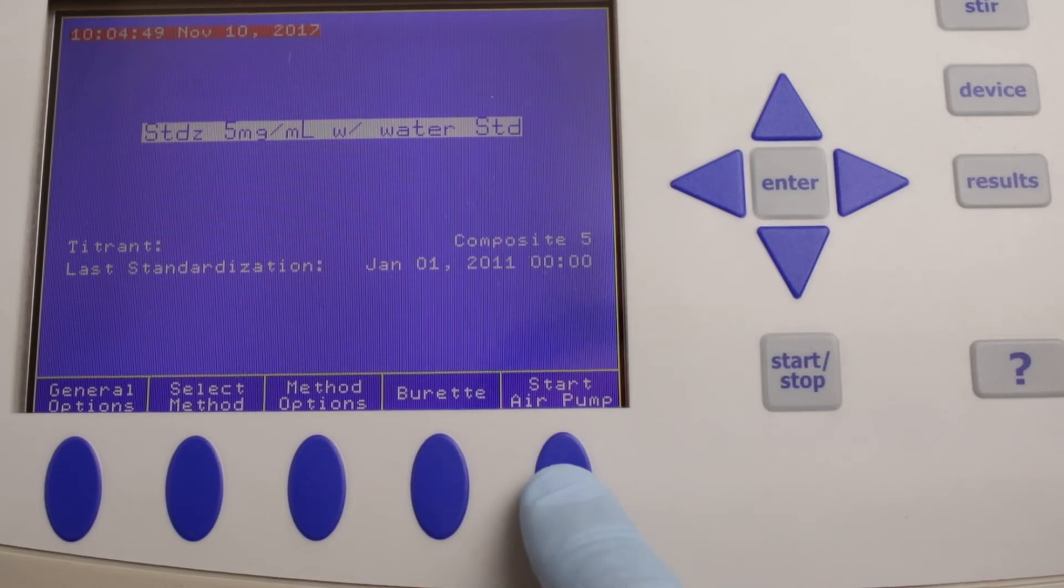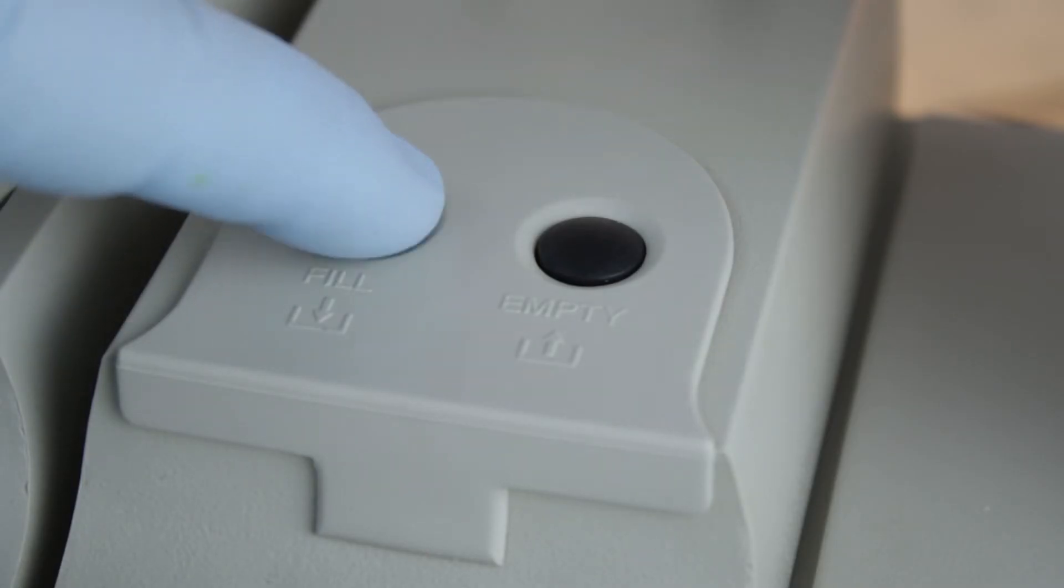To do this, press the start air pump button. Then press and hold the fill button on your air pump.